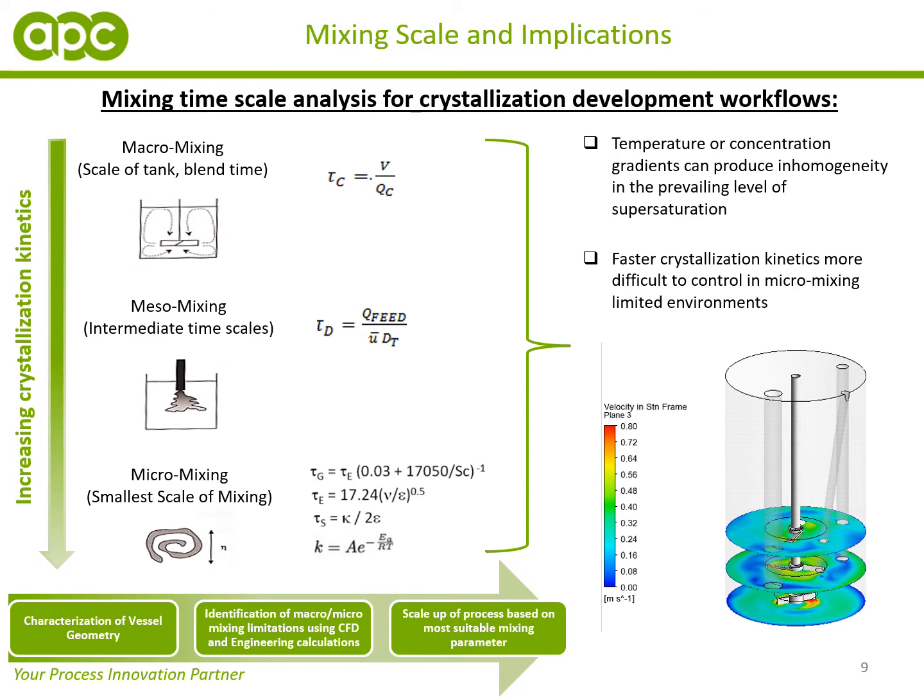So we wanted to understand the mixing environment a lot better in both the lab and plant scales for the process that we were looking to improve. Typically when we're doing this, we look at the macro, meso, and micro mixing environments and the timescales associated with them in order to understand the mixing environment a lot better.